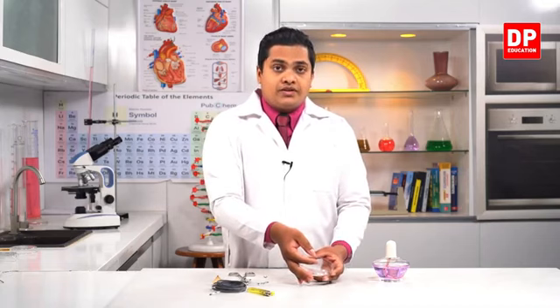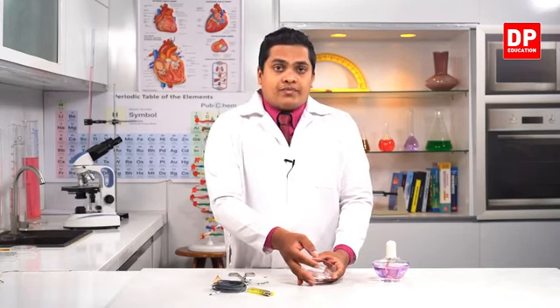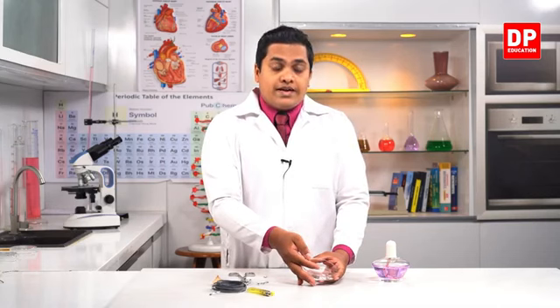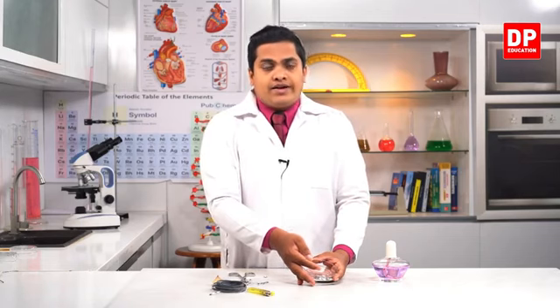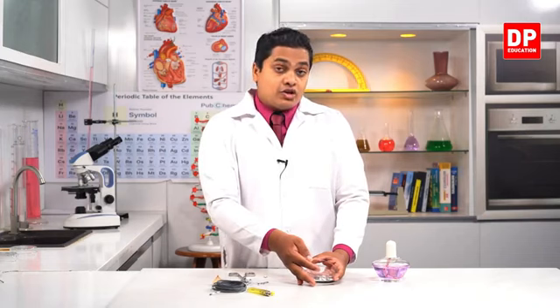You know that in your previous grades you observed that when something is burning, oxygen is very important, right? When you burn anything, that material is going to bond or react with oxygen gas, and the chemical structure, the composition of the material, is dramatically changed. It's changing into a different form. In the earlier part, we burned a paper, and I told you that that's a chemical change.